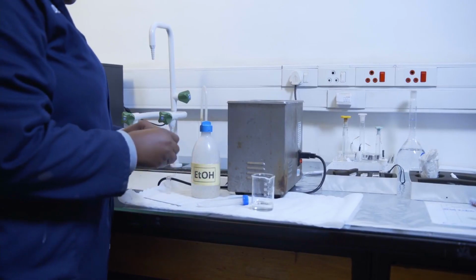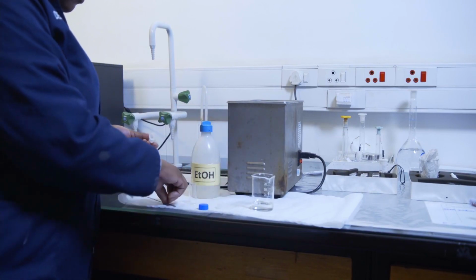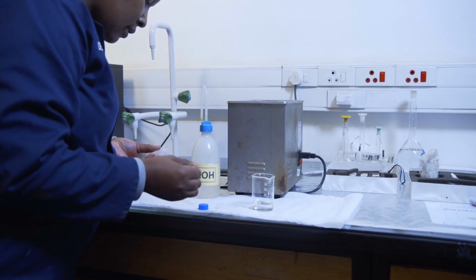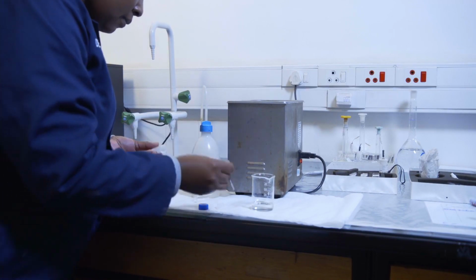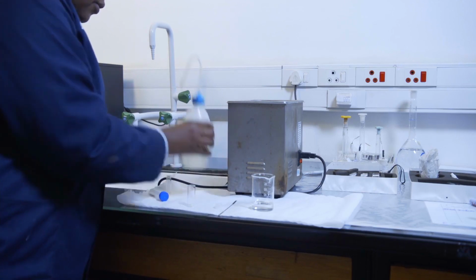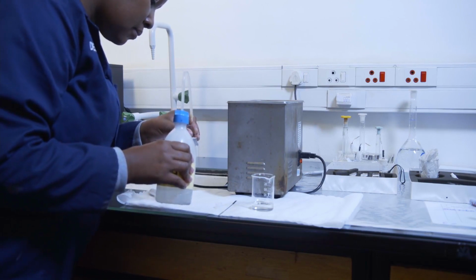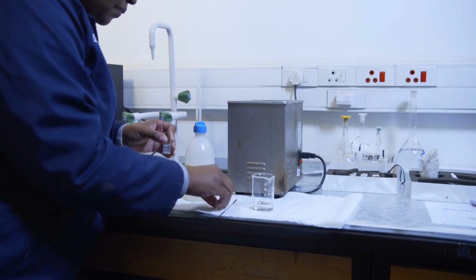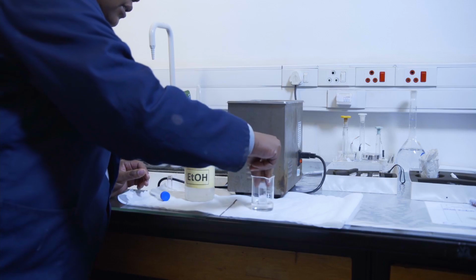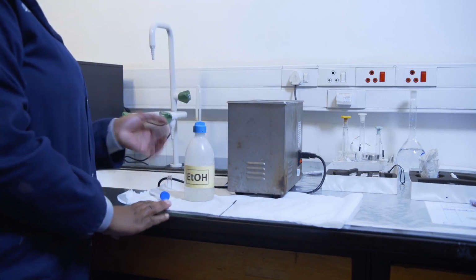We'll then take our vial and we'll take a spatula tip of our zinc oxide and then place it in the vial. And then we'll pour absolute ethanol on our sample. We'll then close our vial and put it in a beaker with some water, and then put it in the sonicator and sonicate for around 10 minutes.